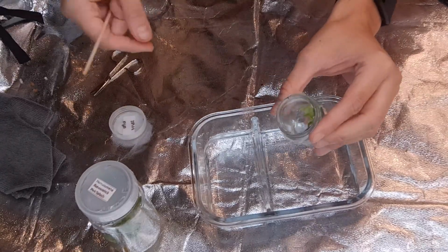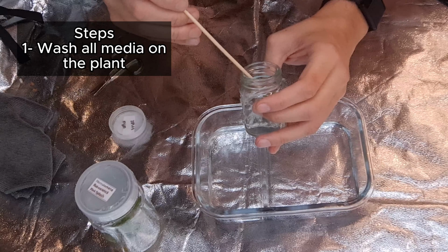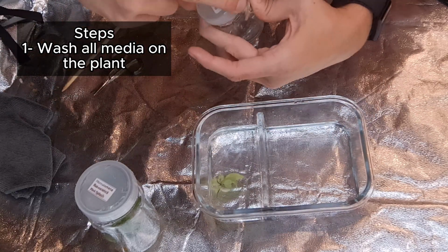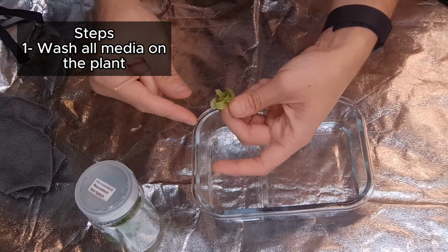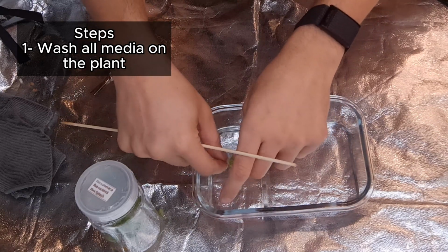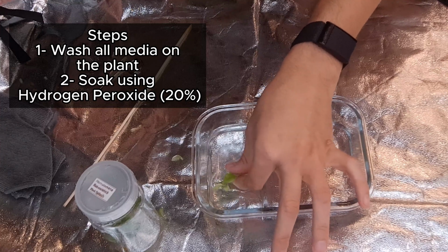I use a skewer basically to just fish out the plant really quickly, trying to not touch the sides or anything that has any of the mold. I basically just drop it, close the container, and then rinse out everything, any agar, anything that is attaching to the plant. In this case, there was almost nothing. So ideally you would do this under the faucet or something like that. And then you're gonna put it in the solution with the hydrogen peroxide for maybe 2 to 5 minutes.